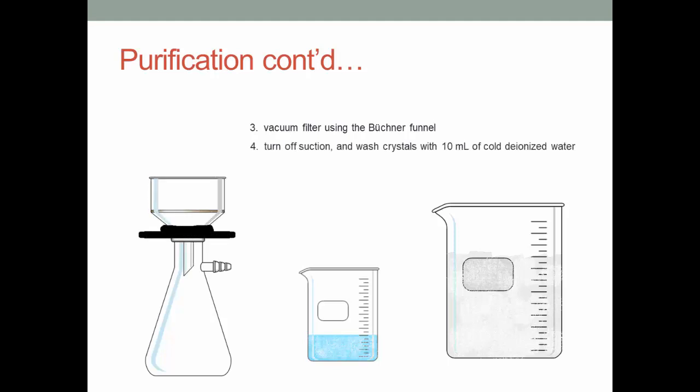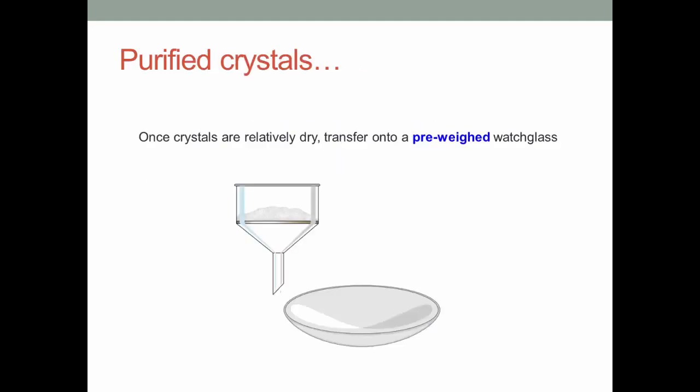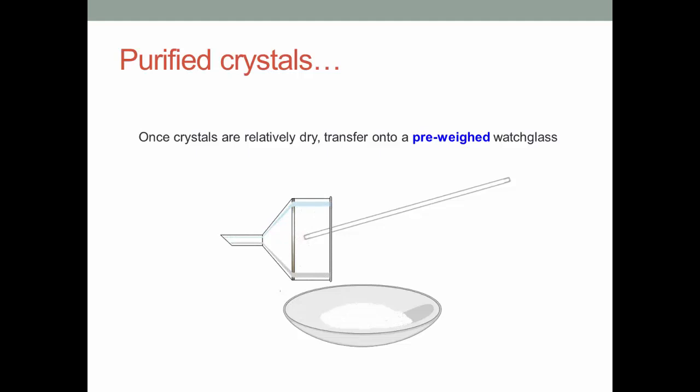When done, turn off the suction and wash the crystals with 10 ml of cold, deionized water. Then, turn suction back on and allow the crystals to dry as much as possible. Once the crystals are relatively dry, transfer them onto a pre-weighed watch glass. Re-weigh the watch glass to determine the mass of crystals. And keep your crystals because they will be needed next week.